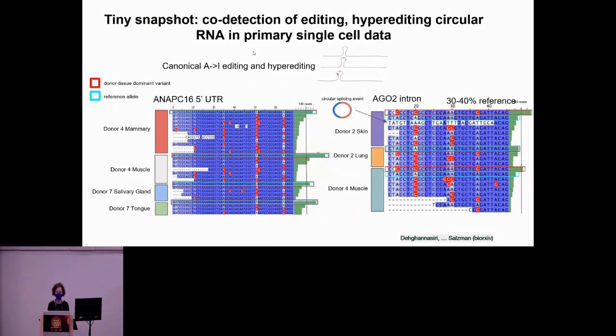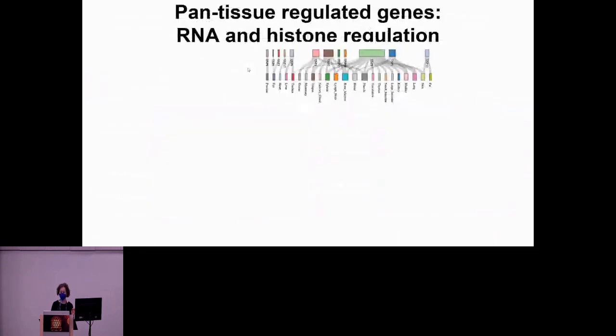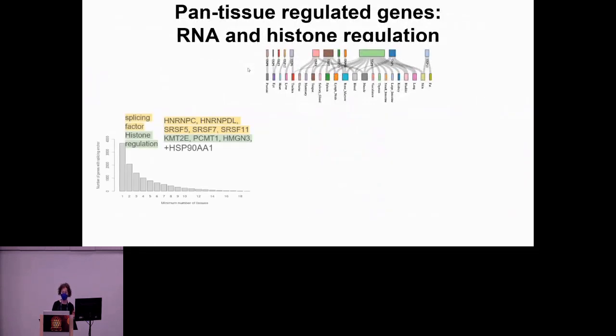Okay, so SPLASH should find it, and indeed it does. This is also a classic case where alignment is going to struggle. If you don't know a priori where hyperediting or editing occurs, it is going to be very, very difficult, if not impossible, to precisely quantify and detect all of these variants, especially at single cell level, where I'm not aware that it has been done.